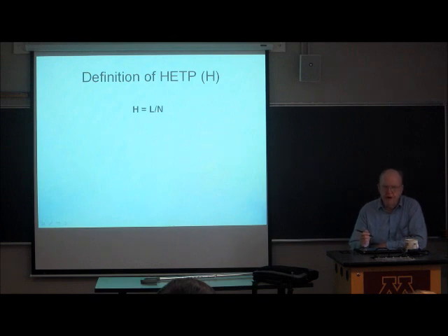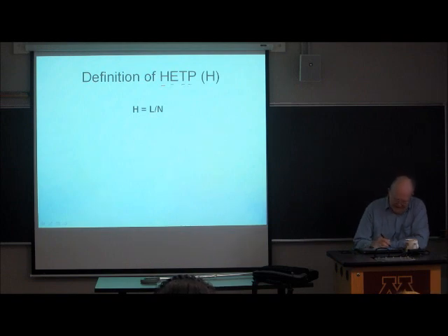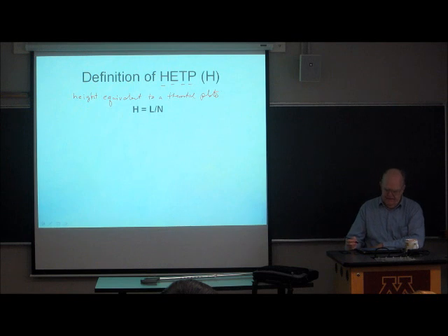There's a very important property of a column, which depends upon a lot of those variables that I just mentioned, called its HETP, which stands for height equivalent to a theoretical plate. And we abbreviate this as HETP or big H.